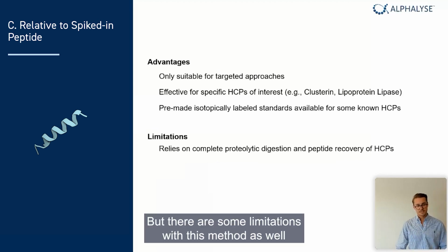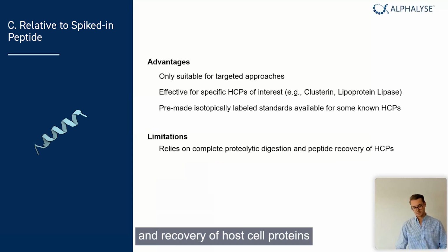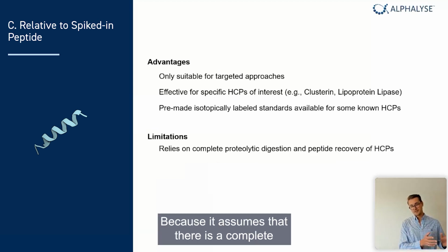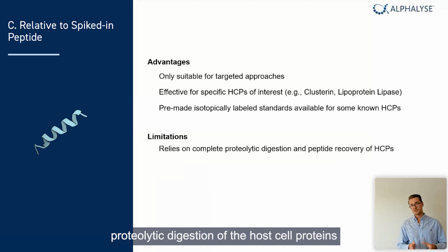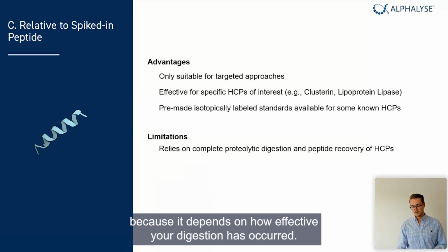But there are some limitations with this method as well. For example, it relies on complete proteolytic digestion and recovery of the host cell protein peptides. Because it assumes that there's complete proteolytic digestion of the host cell proteins, the results may not always be comparable because it depends on how effective your digestion has been.